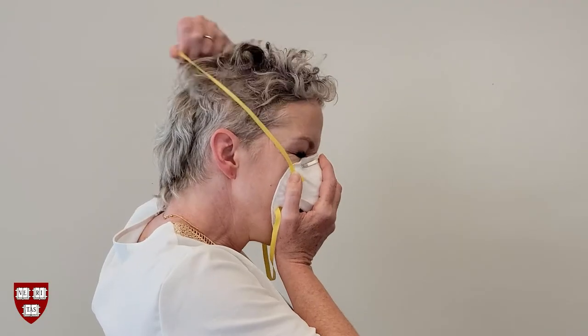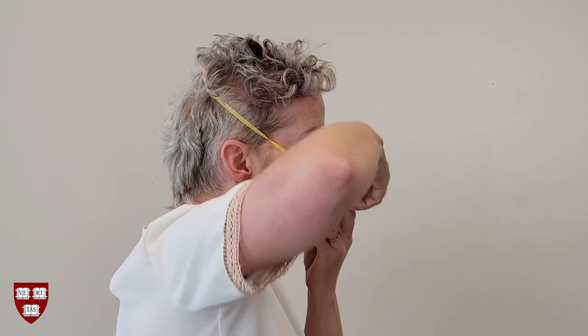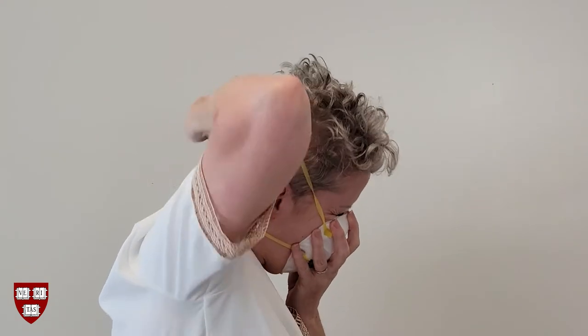Next, with the filtering facepiece face down in your cupped hand with the straps hanging down, place it over your nose and mouth with the nose clip over the bridge of your nose. Grab the top strap and pull it over your head, positioning it at the top part of the back of your head. Grab the bottom strap and pull it over your head, positioning it at the back of your head, near your neck, under your hair.